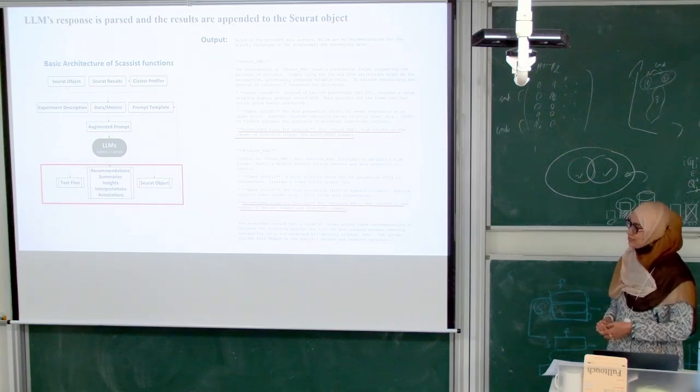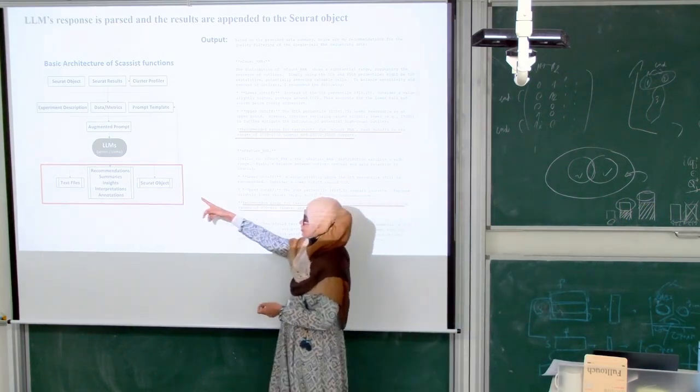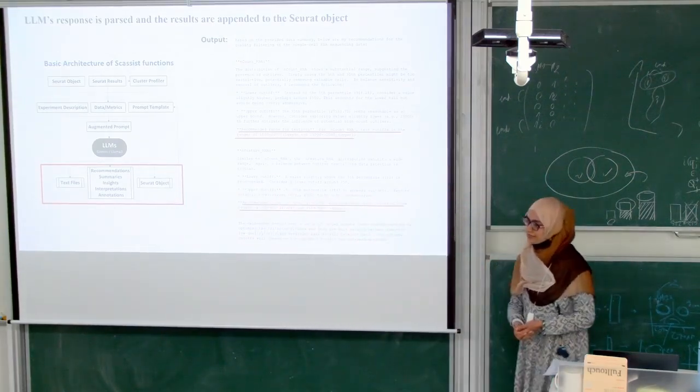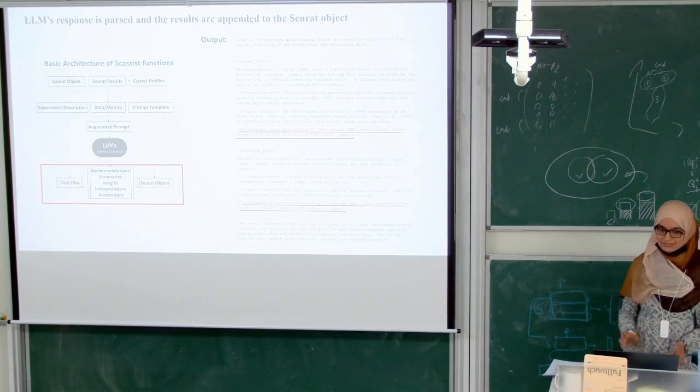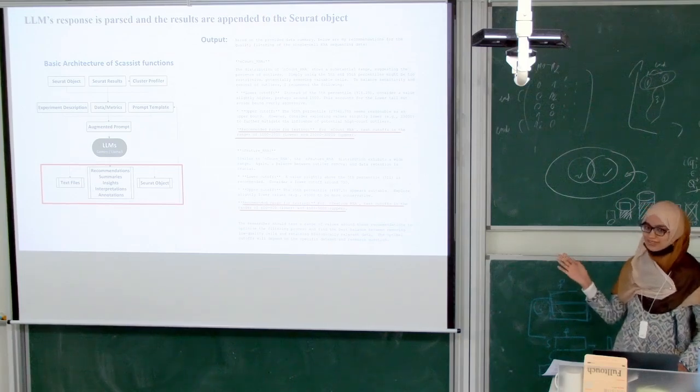Yes. It can also generate the Seurat object that will be used as the input for the next step. So this is the basic way the functions work, and most of them are the same.